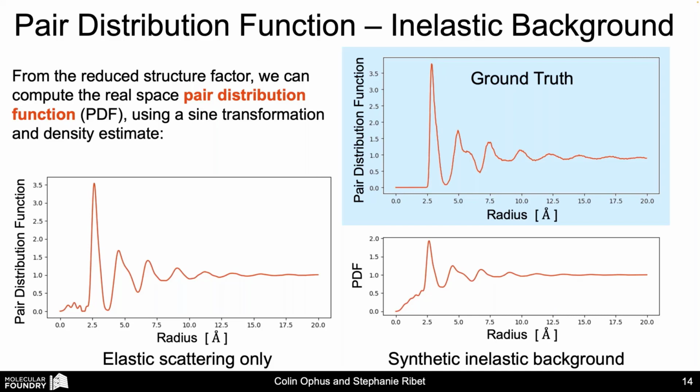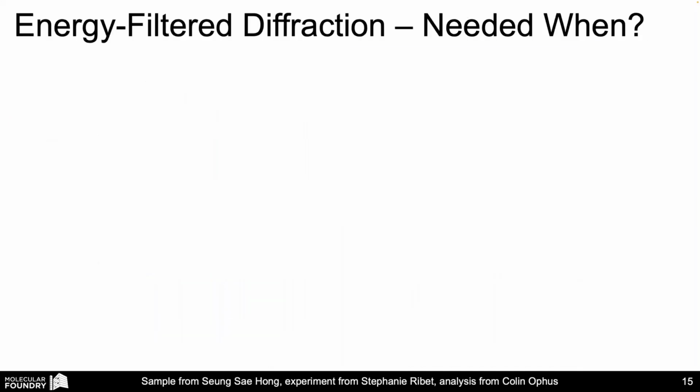It's extremely important if you want to do quantitative studies where you're using your diffraction intensities. Without energy filtering, we just can't make accurate measurements like PDF measurements here. So the other question I should point out here is, when do you need energy filtered diffraction?